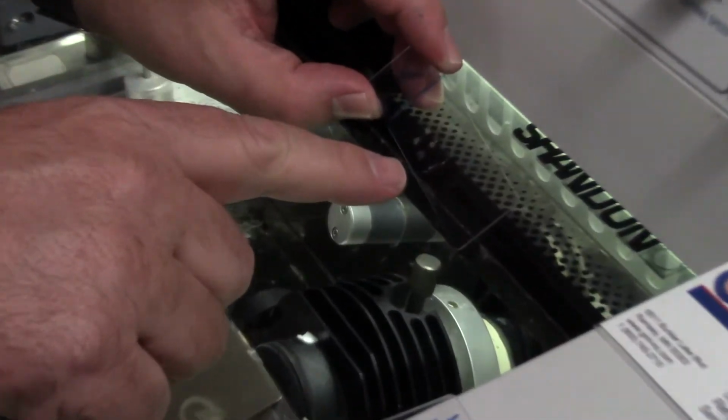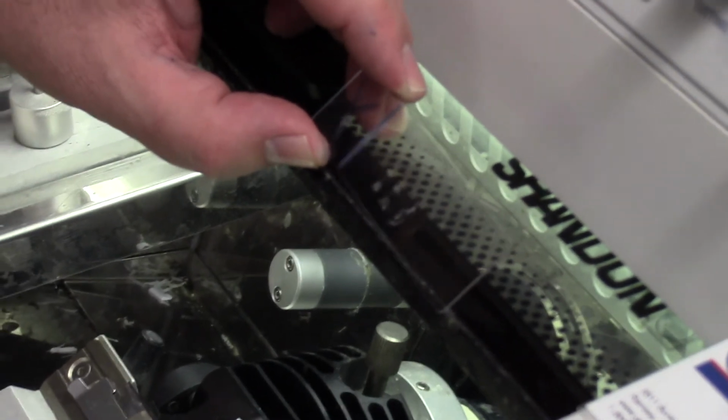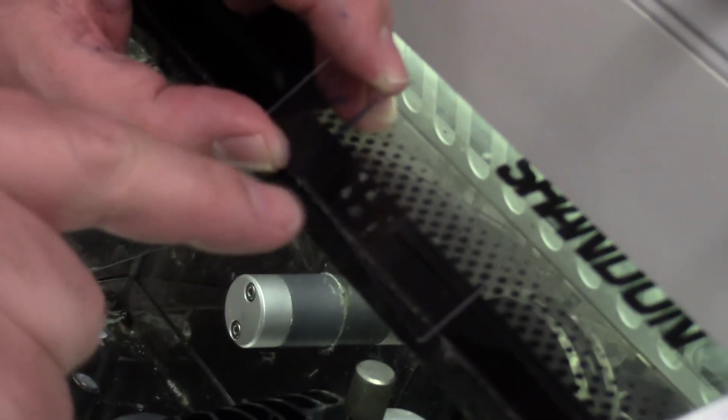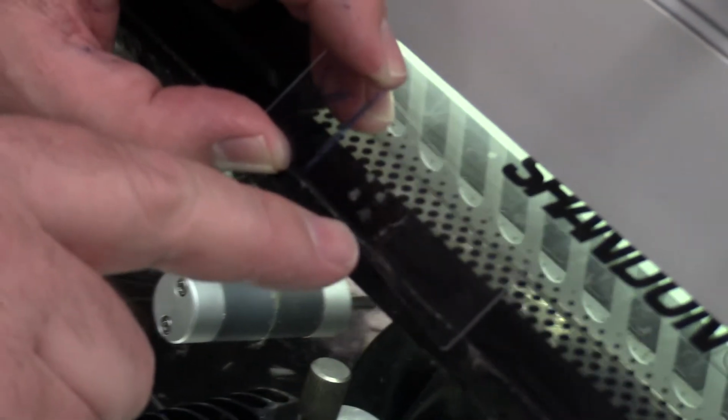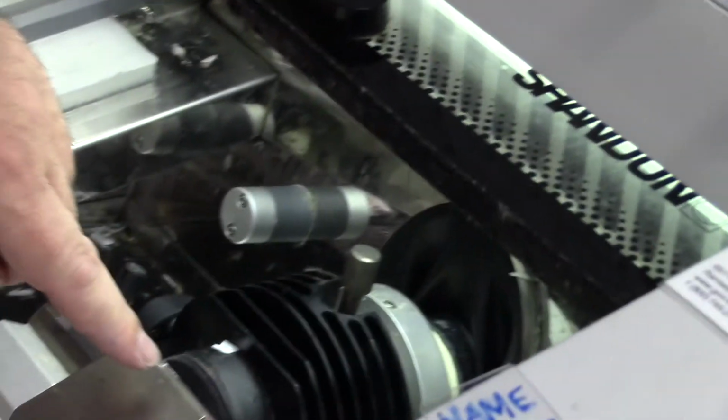Yeah. Oh, that's terrible. Okay. I'm glad we recorded this one. That one's awful. Okay. So we've got 2 beautiful tissue sections of each of ours, and then we're missing all the tissue. Most of the tissue is still stuck right there.